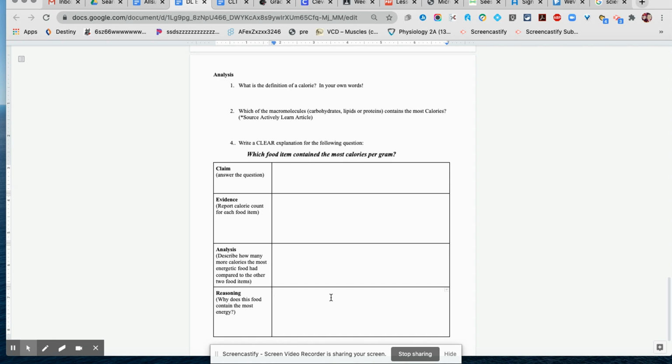Okay, so we're not splitting the roles. We're not saying you do part one, I do part two. We're working through it together. All right, here we go.